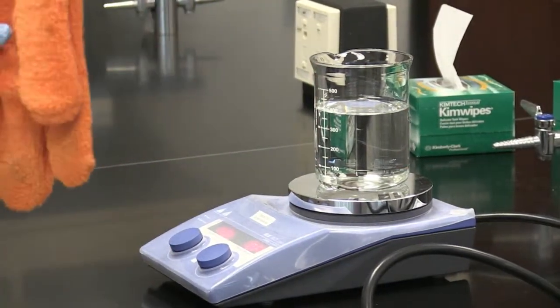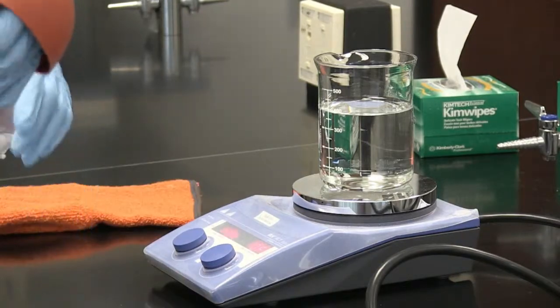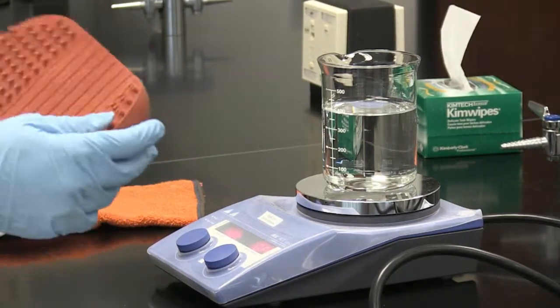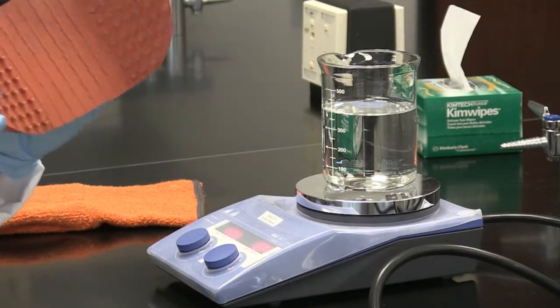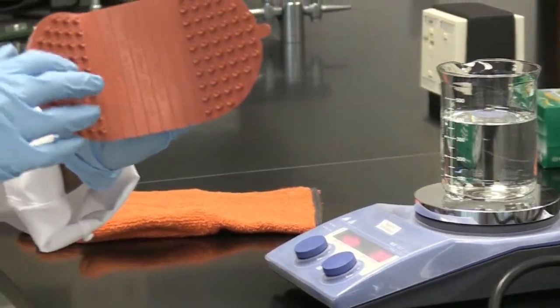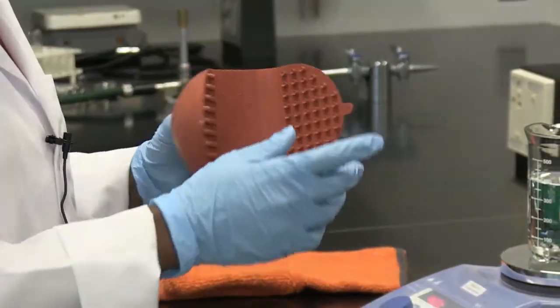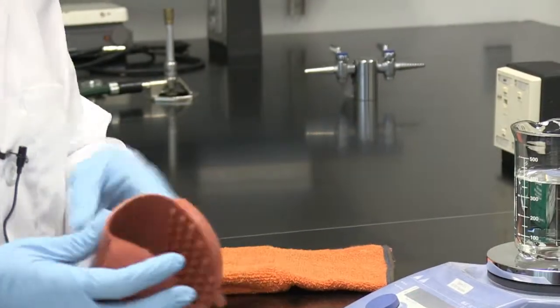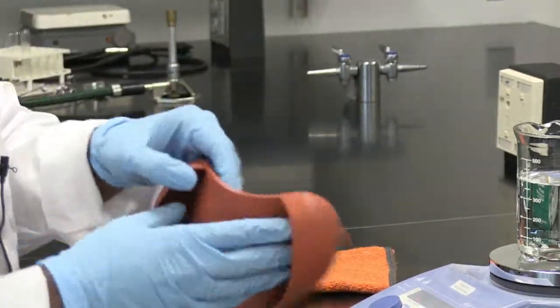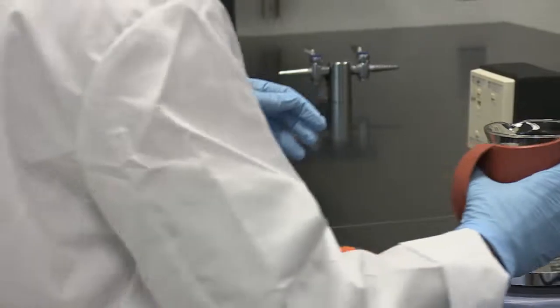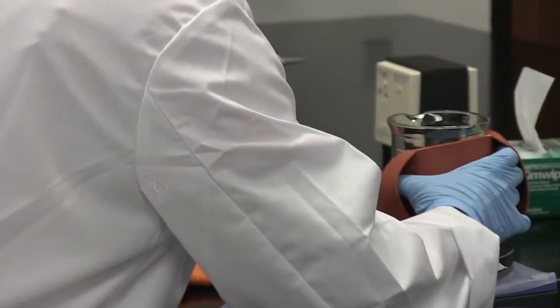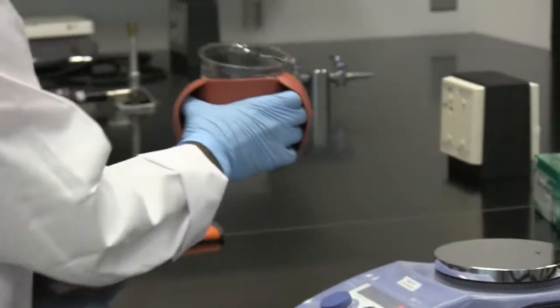In the lab, you'll be provided with a heat-resistant glove or a rubber device that has rubber grooves so it will grab onto the beaker without it slipping from your hands. Personally, I like this one, so I'm going to use it to remove the beaker from off the hot plate.